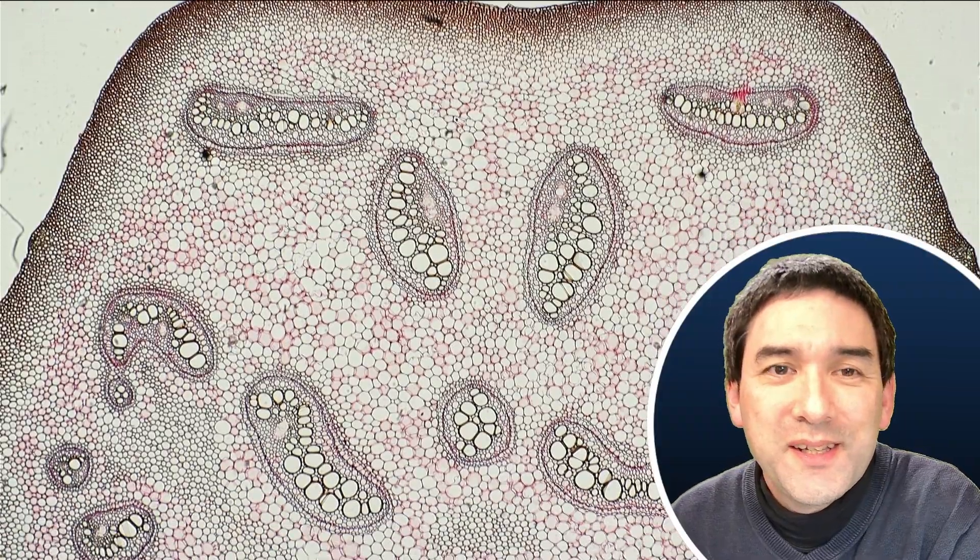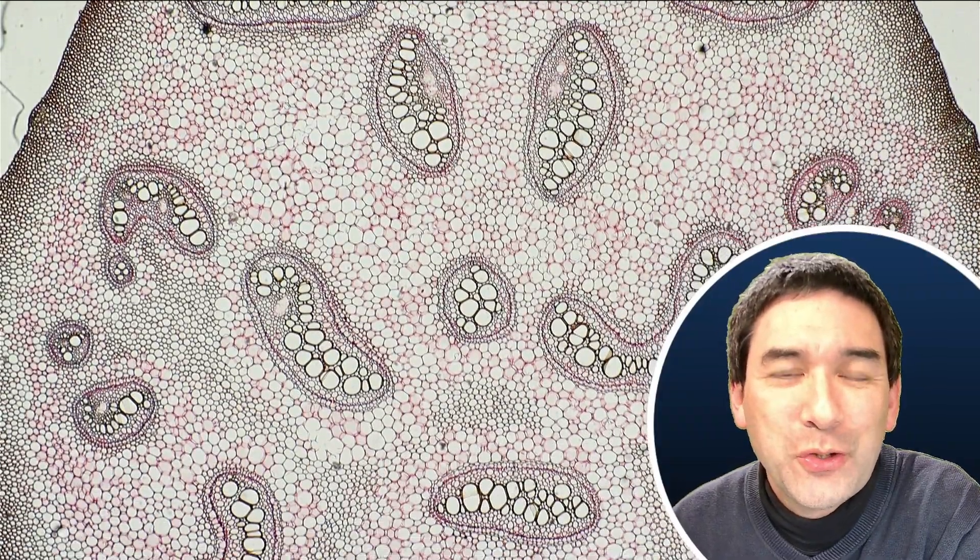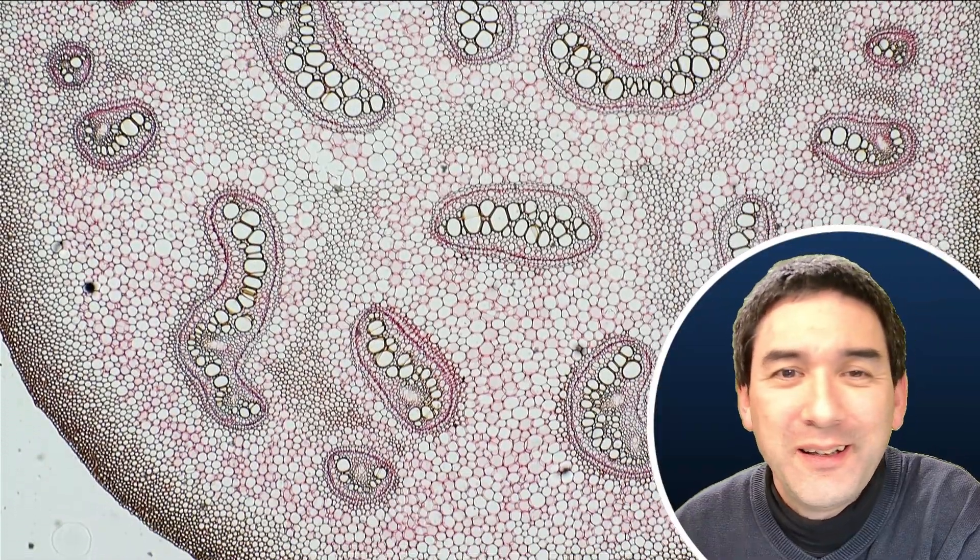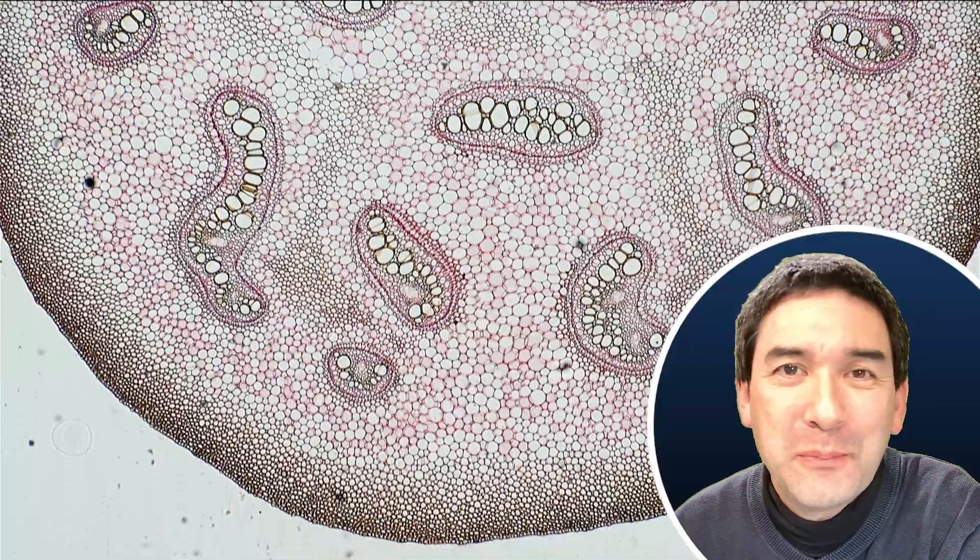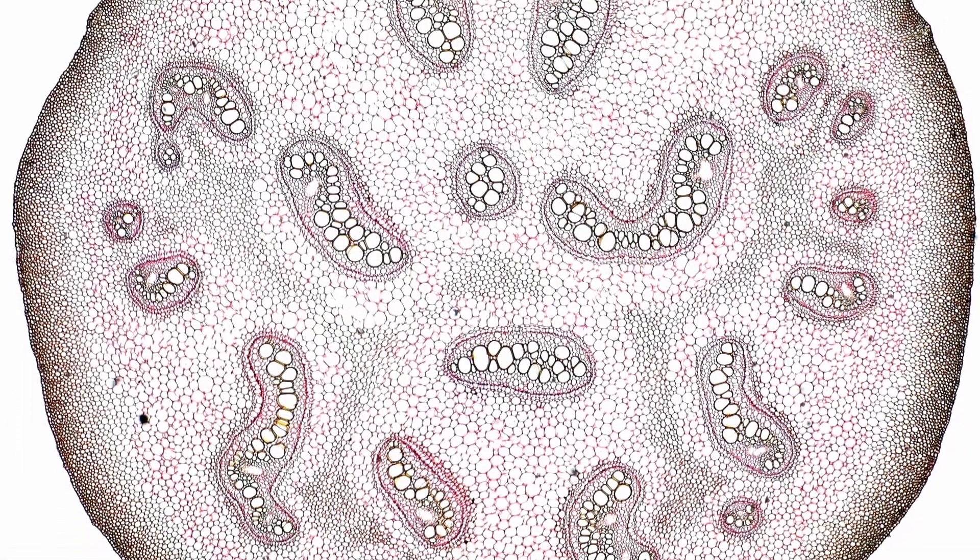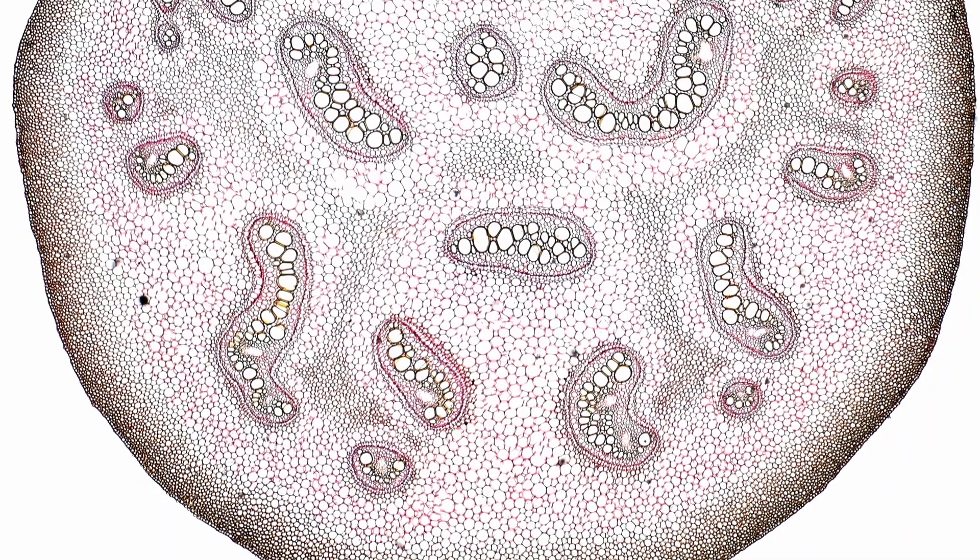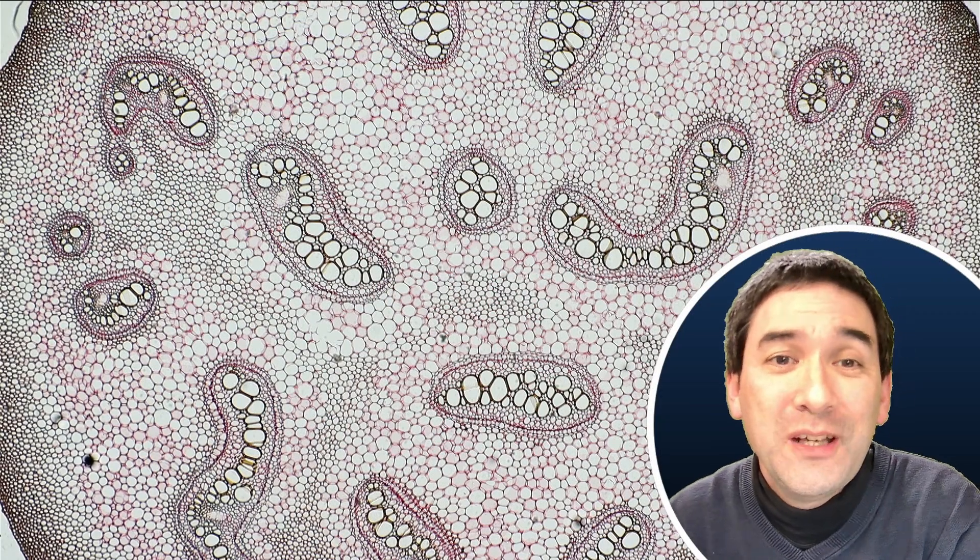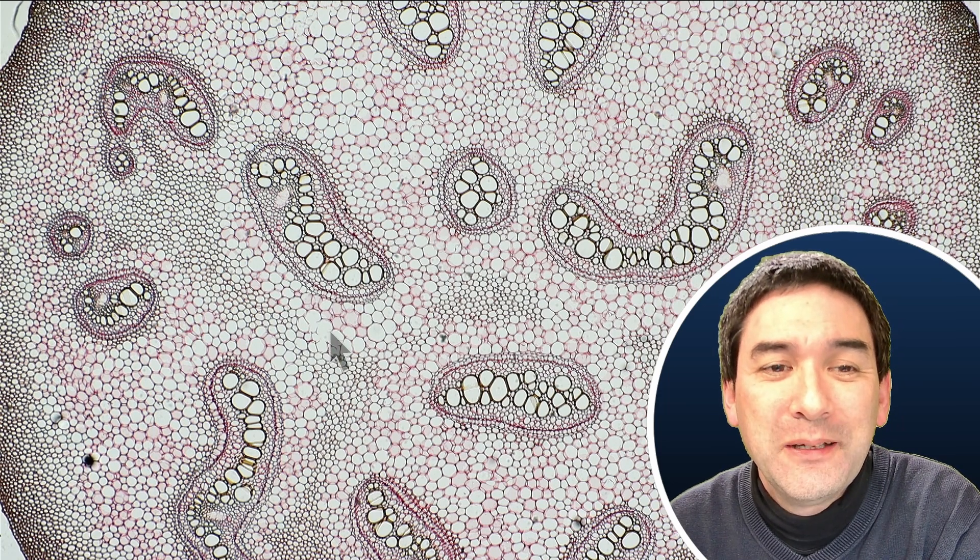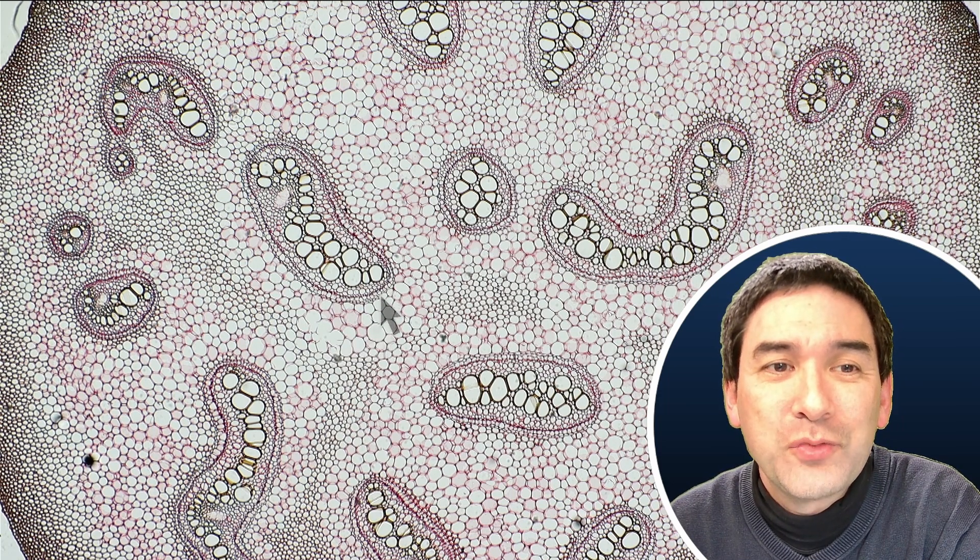So this is how the stem cross section looks like under low magnification using a four times objective. I think plants generally have very pretty specimens under the microscope. And we can see the individual cells. These are the round circular structures. And then, the whole strange irregularly shaped structures that you see here.